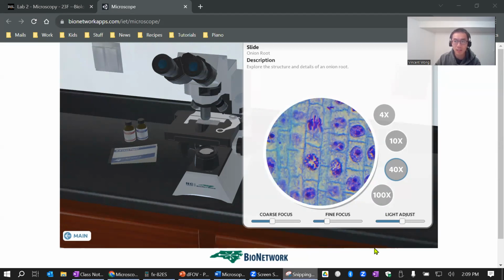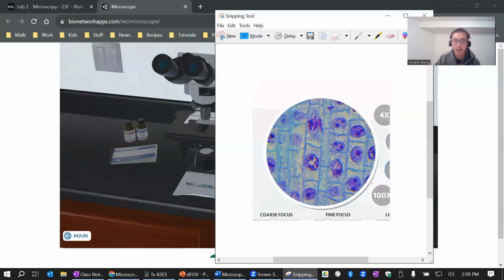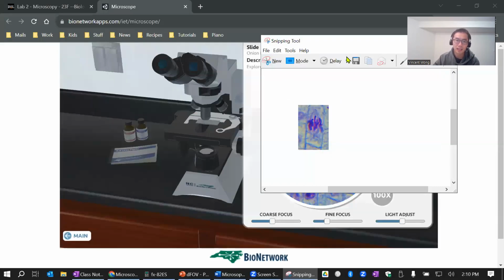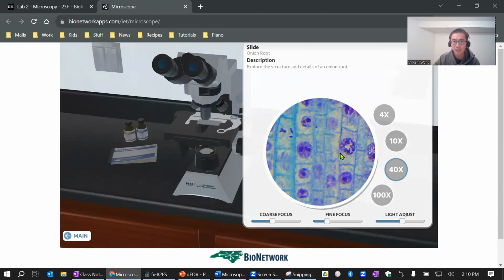This is, again, using the screenshot function. Don't just copy the whole thing and make me find the anaphase. I'm not gonna give you marks for it. If you capture the whole thing, then you circle the cell that you think is an anaphase. This is not anaphase, I'm just saying. If you're gonna take a whole picture like that, make sure you circle the cell that is anaphase. Otherwise, just copy the exact cell that you want, and then you paste it in there. Do you understand? So you have to go around and find the anaphase.